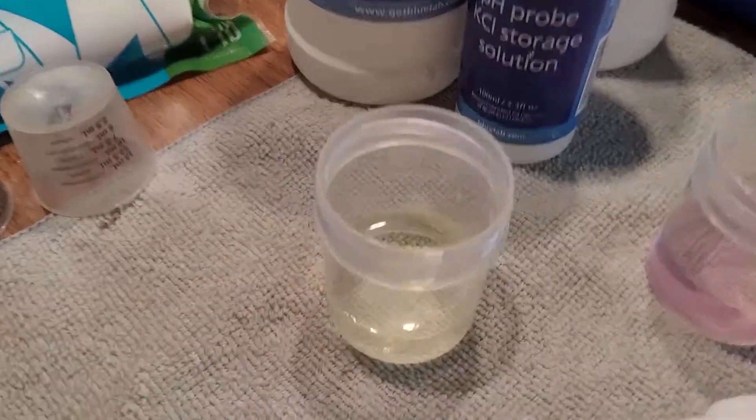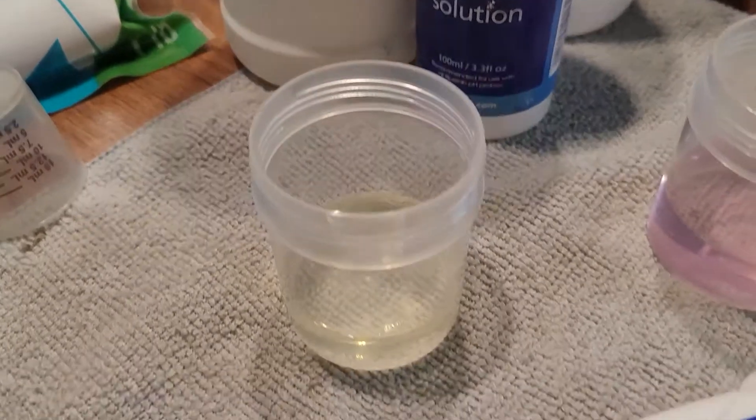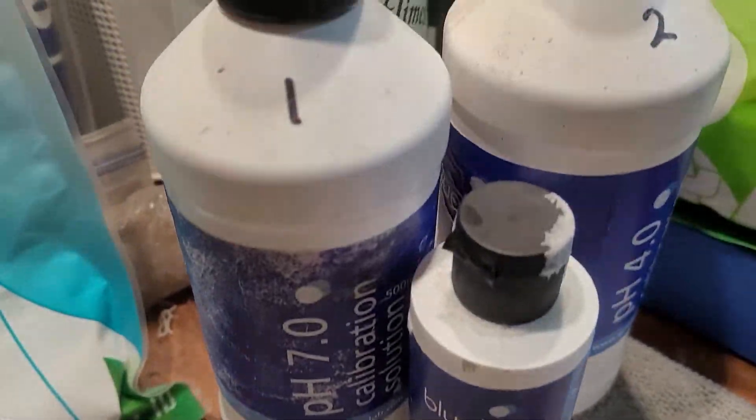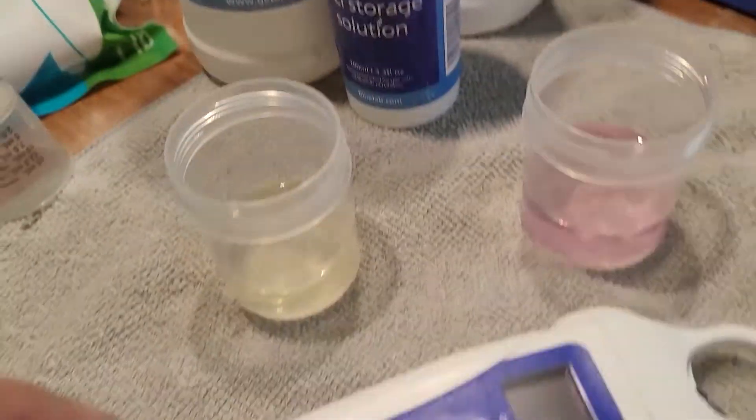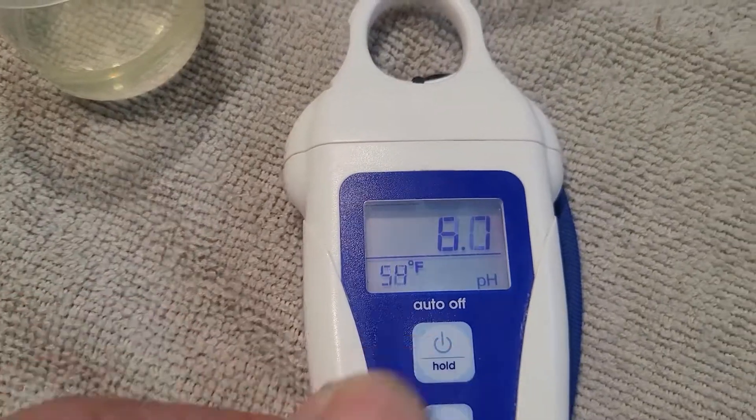Alright, let's get into this. We're going to calibrate these BlueLab instruments here. You're going to need a few things — you're going to need the solutions. The number one we use is the pH 7, and then the pH 4. It's just a stable 7 and 4.